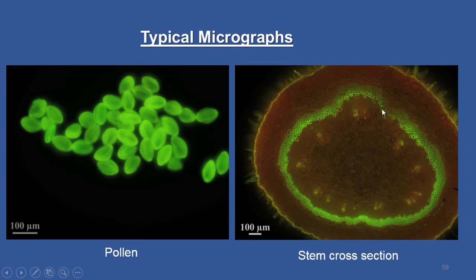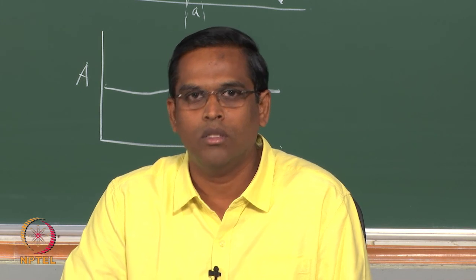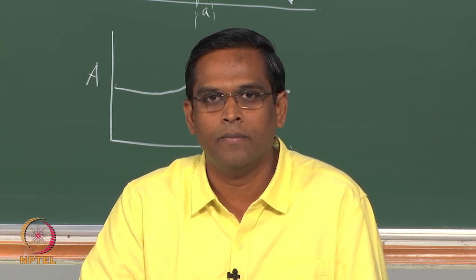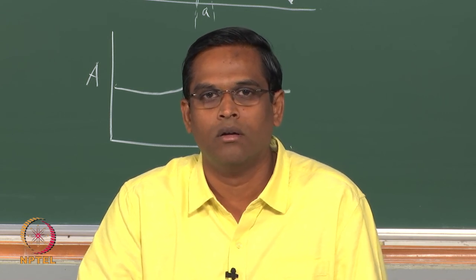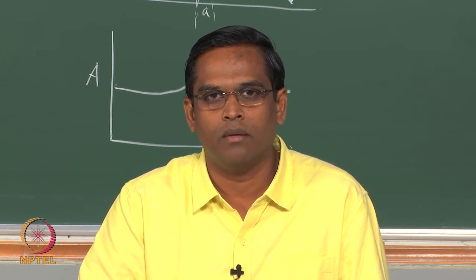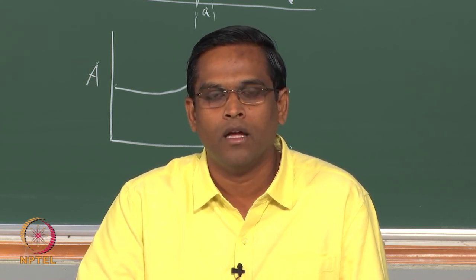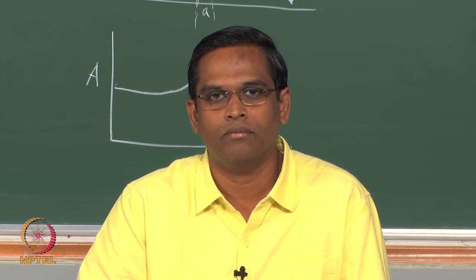I think with this we will stop the discussion on all the optical variants. We will now move on to the next topic, that is how to prepare the samples for optical microscopy. So, in the next class I will take up the different steps one has to go through to obtain a good specimen in order to get a very good micrograph.